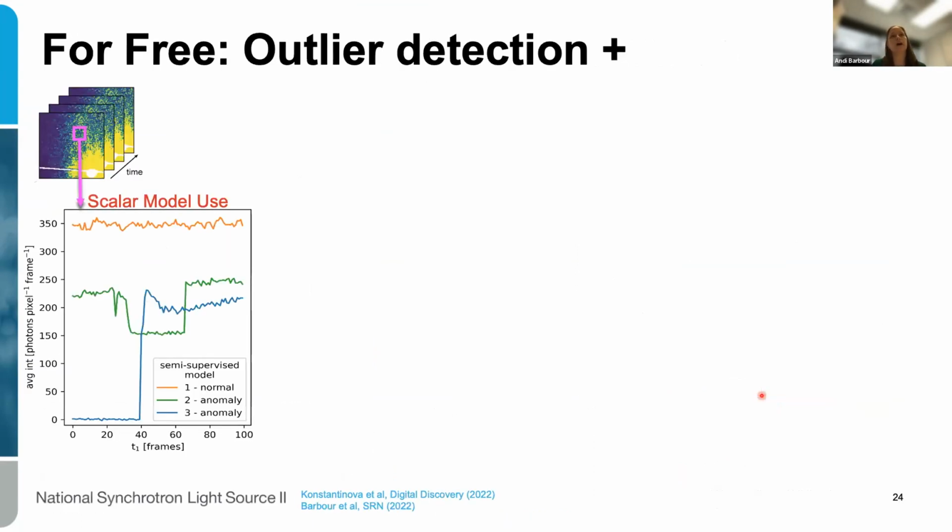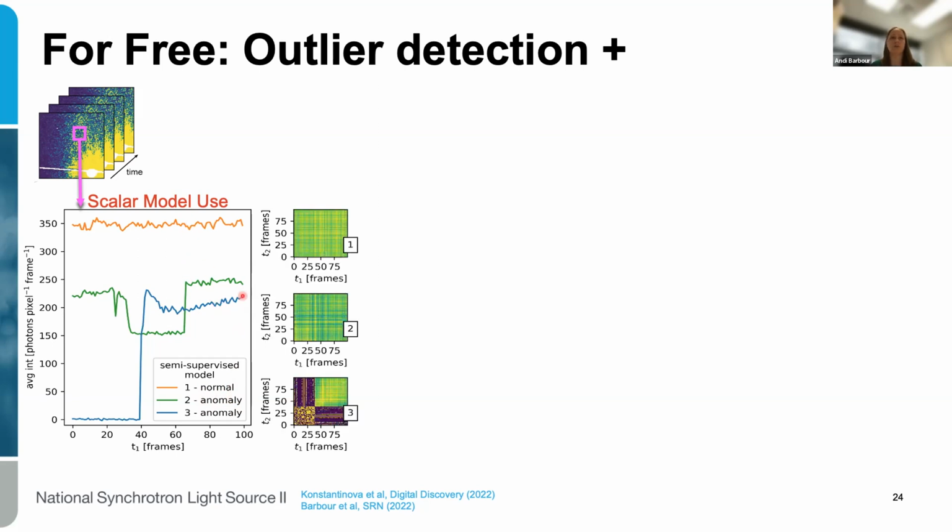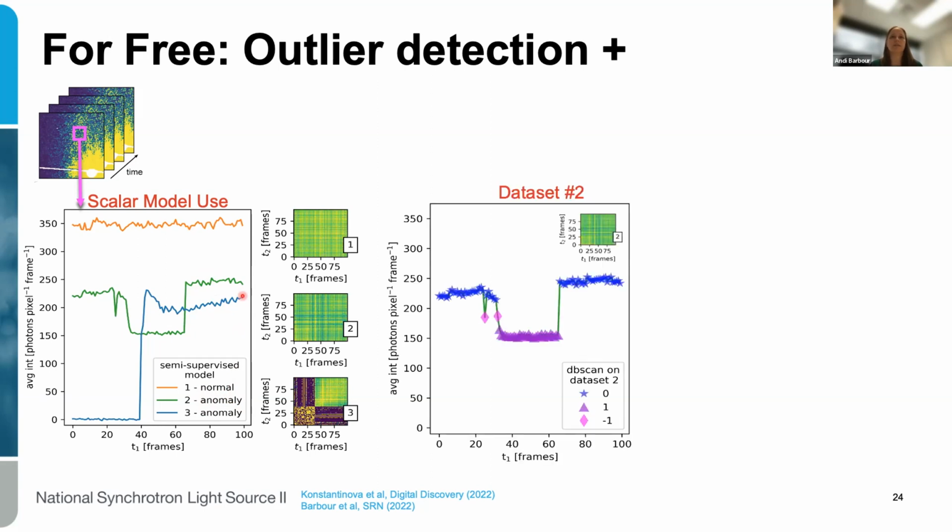We also get outlier detection for free. Earlier I talked about this model with the outlier detection and it being able to predict an anomaly or not from different data sets. In this case, they should all be static. The two times shows a result that looks like this.